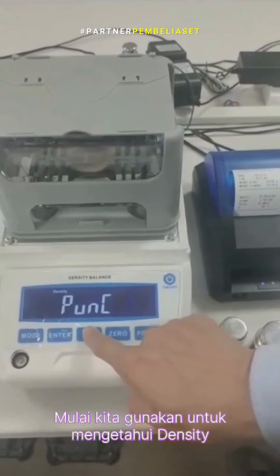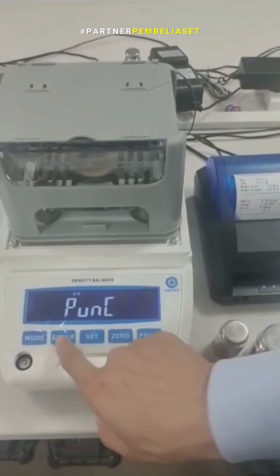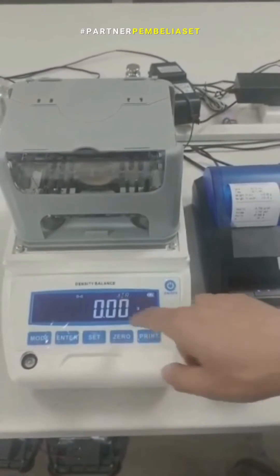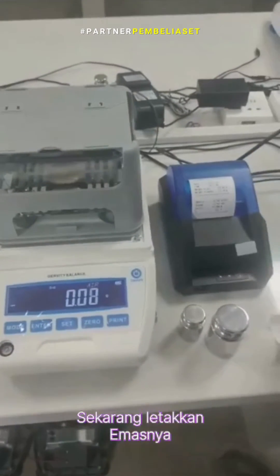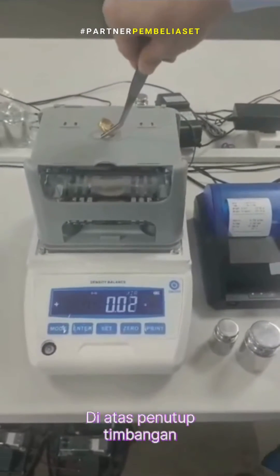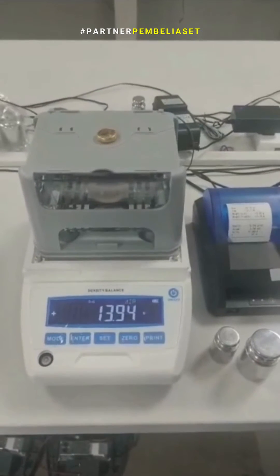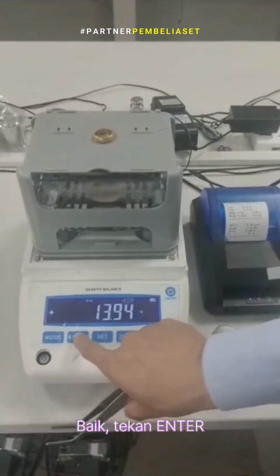Now we use the gold density — press enter key. This is L. Now we put the gold on the top of the balance. Press enter.